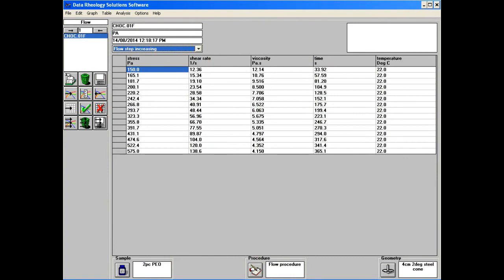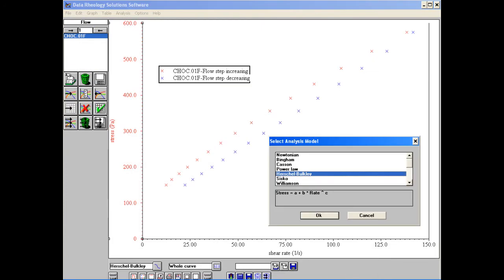The data analysis software then allows us to view and save the values of stress applied, shear rate, viscosity, time, and temperature. Additionally, a range of rheological models can be fitted to the curves.